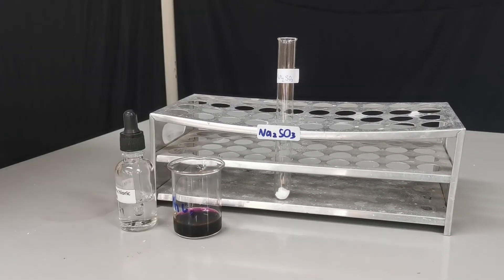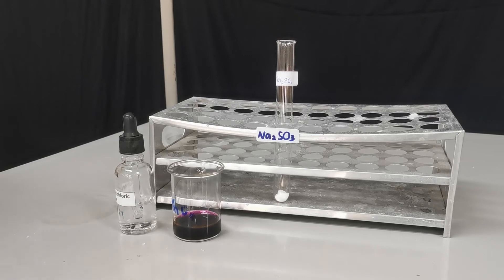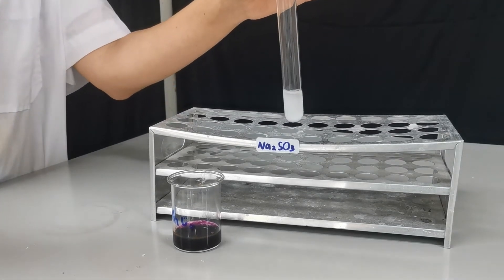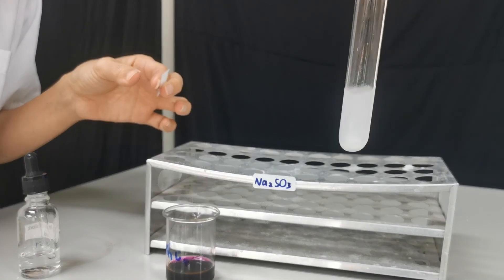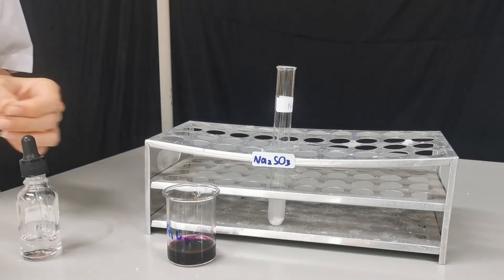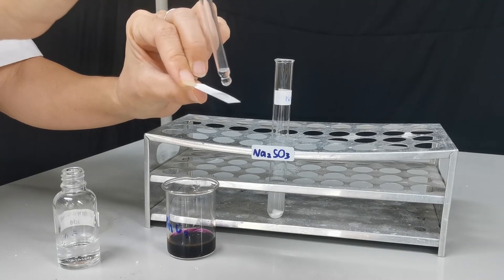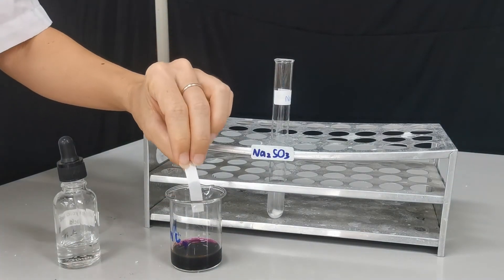The next test we're going to do is the test for sulfur dioxide gas. We can produce sulfur dioxide gas by reacting a sulfite salt with hydrochloric acid — in this experiment I'm using sodium sulfite. You might be able to see the bubbles produced. To test for sulfur dioxide, we need acidified potassium manganate, so on this filter paper we're going to drop one or two drops of hydrochloric acid and then dip it into potassium manganate VII solution.